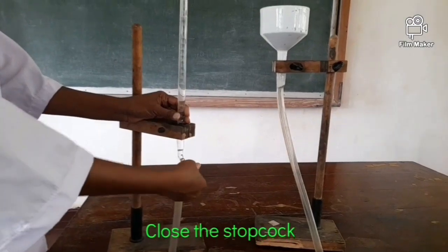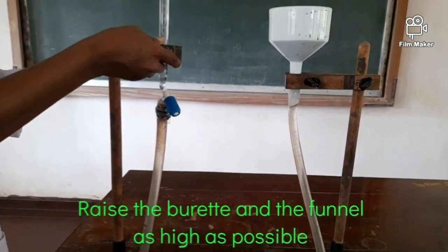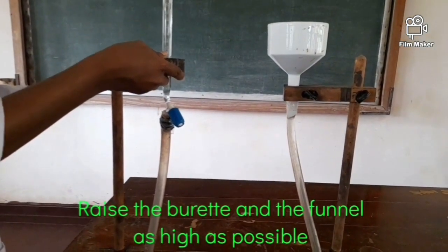Then close the stopcock of the burette and raise the burette and funnel as high as possible.